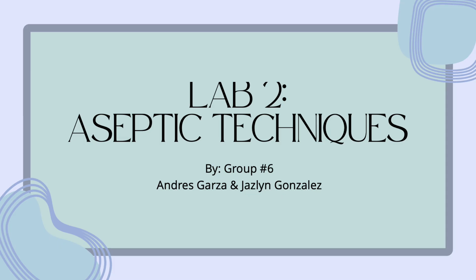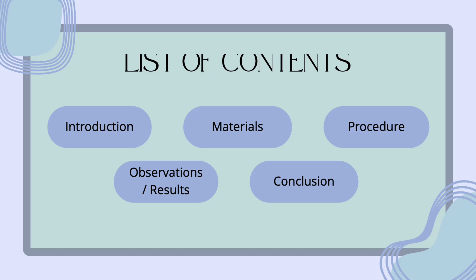Today we will be presenting over Lab 2 aseptic techniques. So a quick list of our contents is the introduction, materials, procedure, our observations and results, and our conclusion.